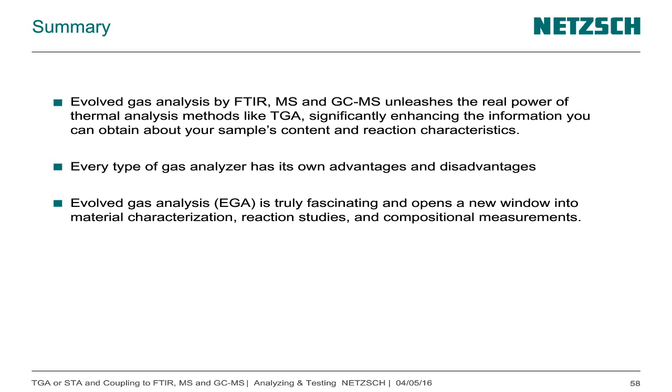The sensitivity of a GCMS is much higher than that of the MS or the FTIR, because with the chromatography it's a smaller part. It's not necessary to use high amounts. So that's why I always use lower amounts with GCMS.